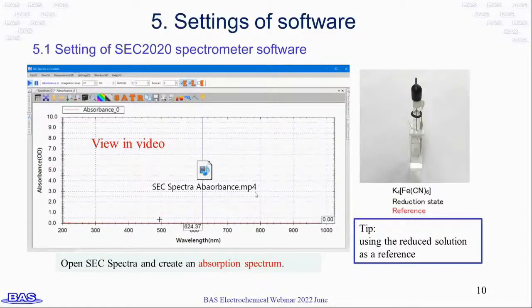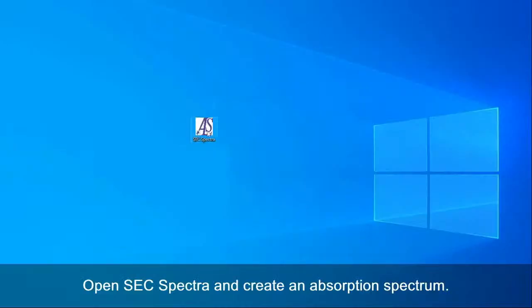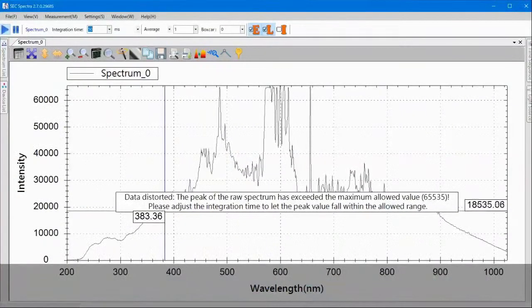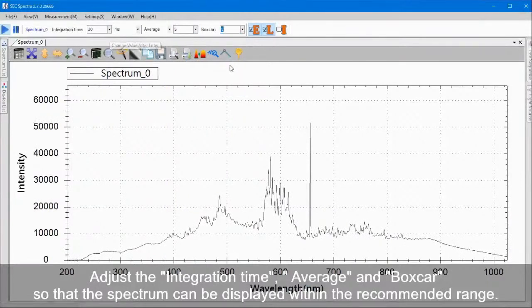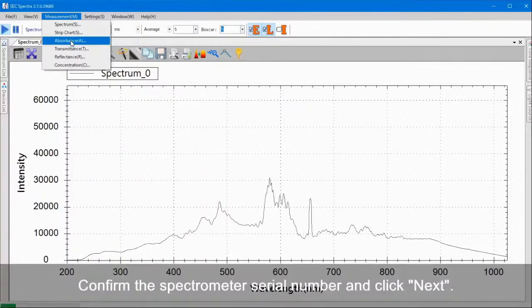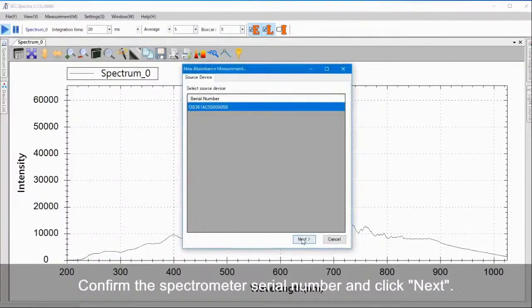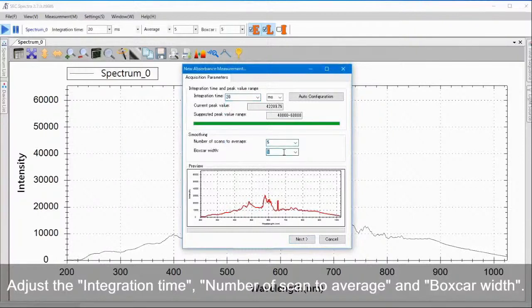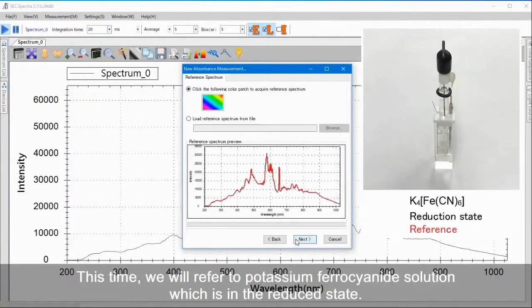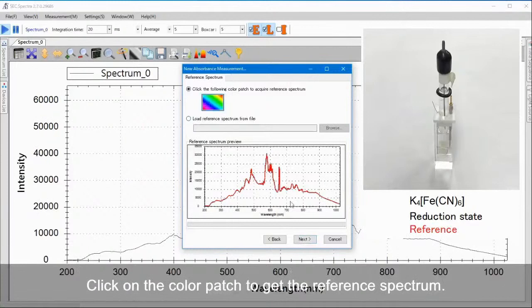Next, set the software of SEC 2020 spectrometer system. At the first step, you need to create an absorption spectrum using the reduced solution as a reference. Open SEC Spectra and create an absorption spectrum. Adjust the integration time, average, and boxcar so that the spectrum can be displayed within the recommended range. Select absorbance on the menu bar. Confirm the spectrometer serial number and click Next. Adjust the integration time, number of scans to average, and boxcar width. We will use potassium ferrocyanide solution in the reduced state as the reference. Click on the color patch to get the reference spectrum.